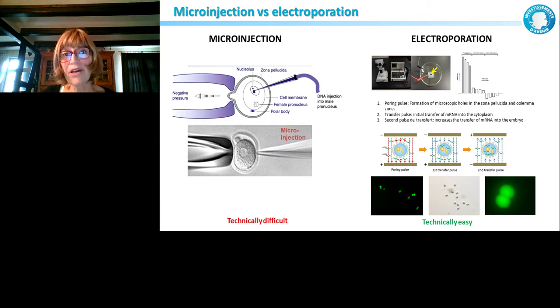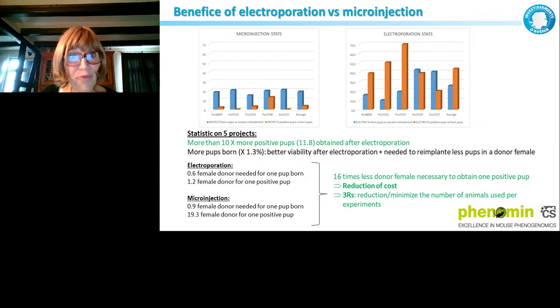electroporators will work. And just to say, first we checked by using mRNA for GFP, and you can see here that it works really well. You have nice 2-cell embryos that are very nicely GFP. And that's what we did. We tested a few projects here, 5 projects, and that's the data we obtained. They are the same project with microinjection, left panel, or electroporation, right panel. And you can really see here that even if you obtain approximately the same number of animals, the number of positives, the orange column, are much, much higher when we use electroporation, because you have not anymore the bias of the microinjection.